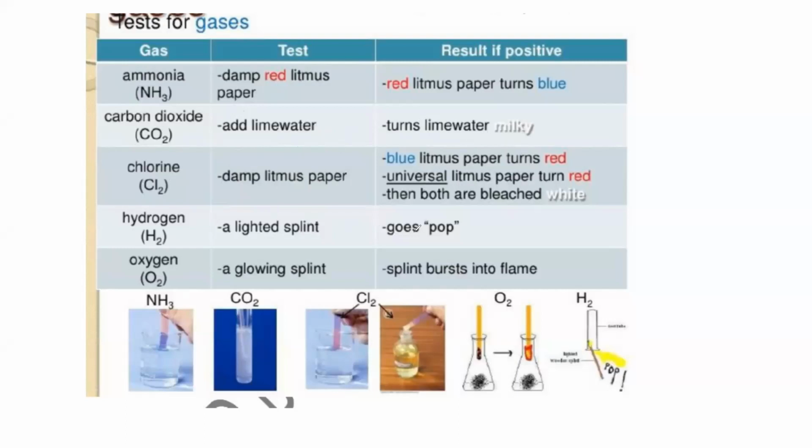If it's hydrogen gas, then it will give a pop sound. A lighted splint gives the pop sound. Oxygen gas: with a glowing splint, it will burst into flame, or the glowing splint will relight.